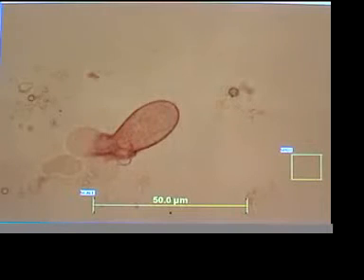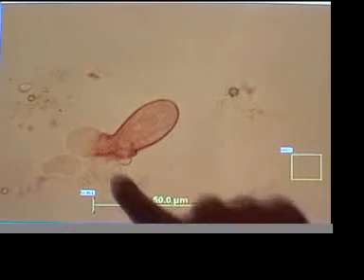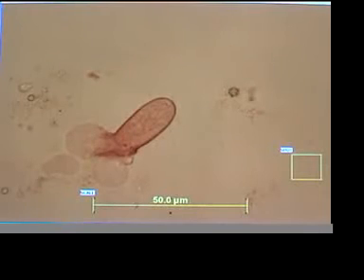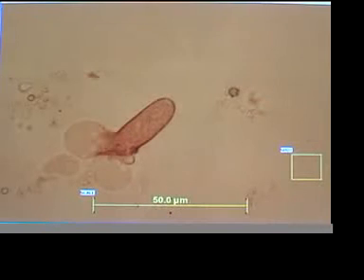And I think we're going to see a dramatic change. Look down here, something's breaking. This is 928 hertz plus 10,164 hertz. This is the first devitalization I filmed at 928 hertz, which makes this very interesting. It's also pretty slow. Maybe you can see things are happening down in the bottom. He's sort of devitalizing in two directions simultaneously. Let's watch him and see what we can see.